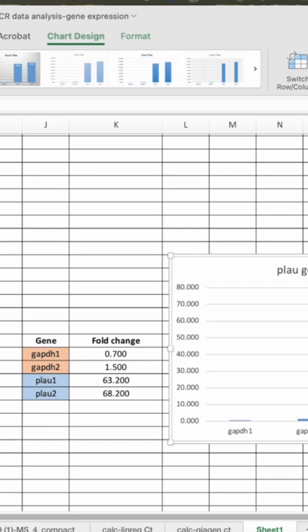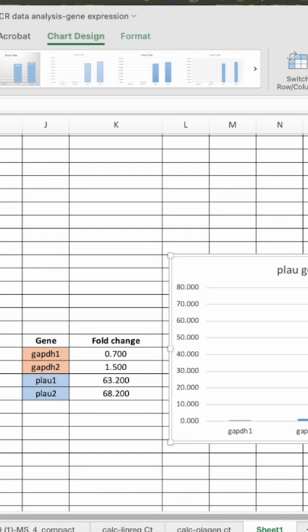But you can select different ones per your protocol and experimental design and ensure that the amplification efficiencies for target and reference genes are pretty similar for accurate results. So here I haven't shown the amplification efficiencies, but I have shown these in my other videos. You can quickly check on it and make sure that you also take the data where the efficiencies are pretty similar between the controls and the reference and target genes.